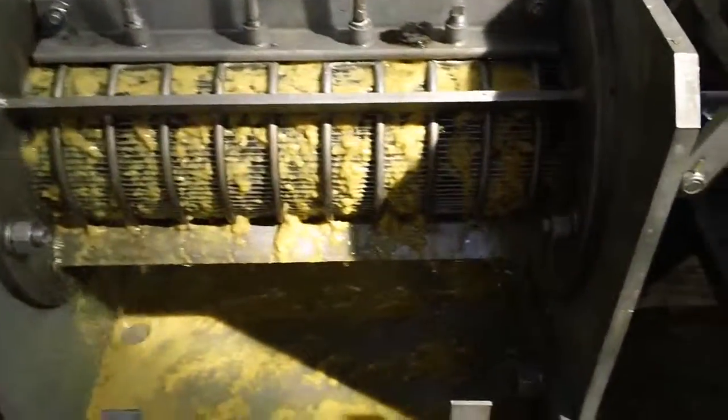Yeah, that's a lot. But here's a paint stir. We may as well, let's help it along. We always use a wooden stick so that if the screw grabs it, it just bites the end off and doesn't cause a lot of damage. Certainly beats trying to stir it by hand. Of course, you would never do that. Oh, I thought that was one of the sticks that had gotten caught.